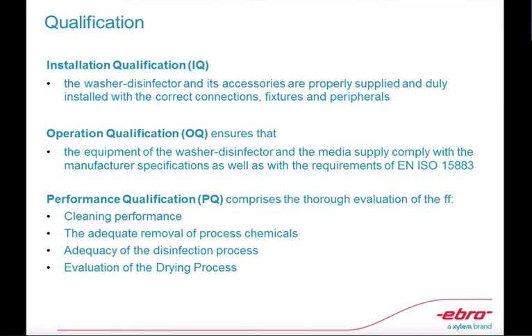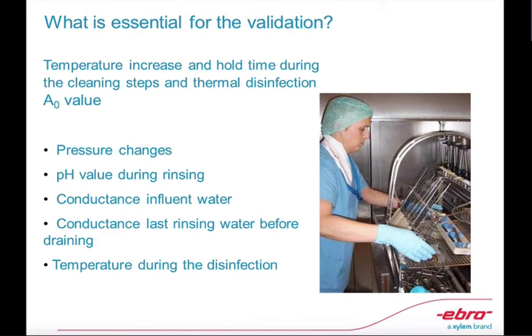I inserted this slide because IQ, OQ, and PQ will guide you with your criteria on dealing with the results that you will get from this.